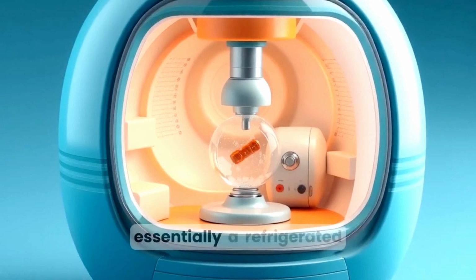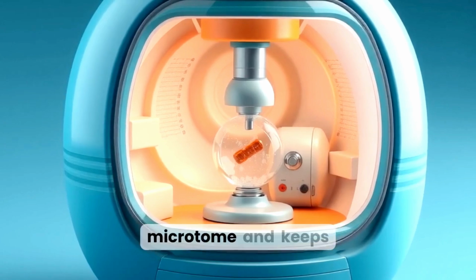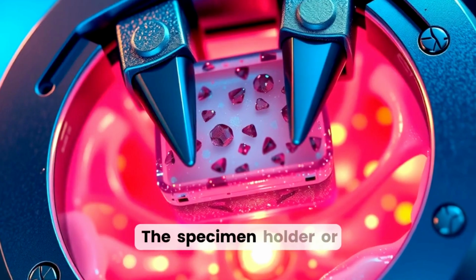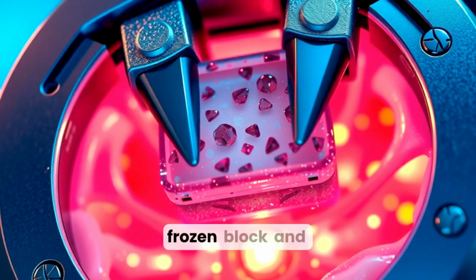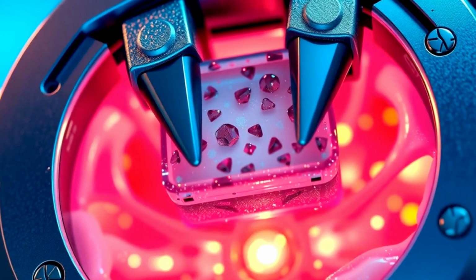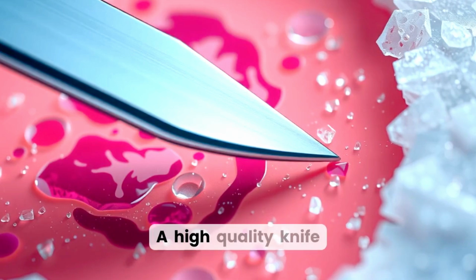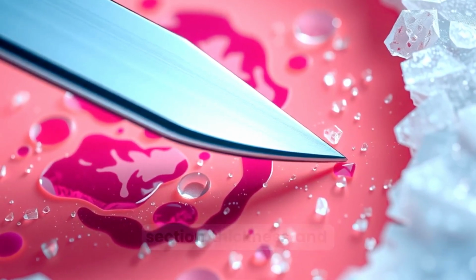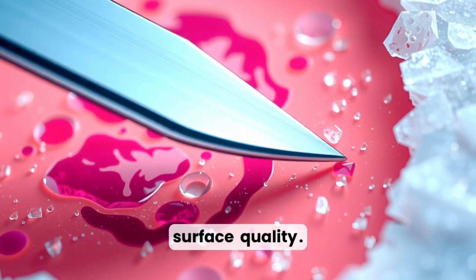A cryostat is essentially a refrigerated chamber that houses a microtome and keeps specimens at controlled low temperature. The specimen holder, or chuck, secures the frozen block and positions it for precise slicing by the blade. A high-quality knife or blade is required. Blade angle and sharpness influence section thickness and surface quality.